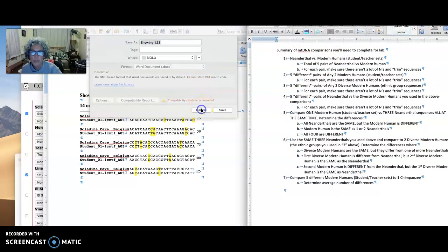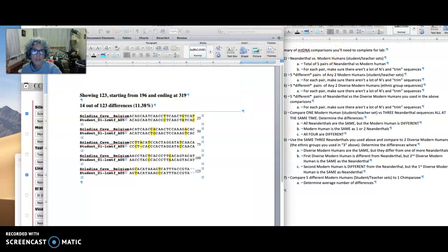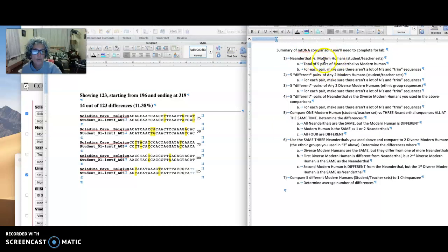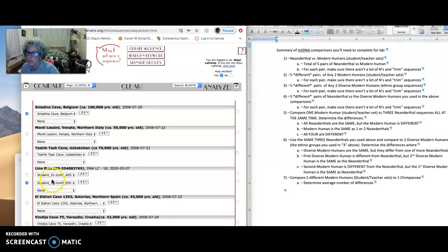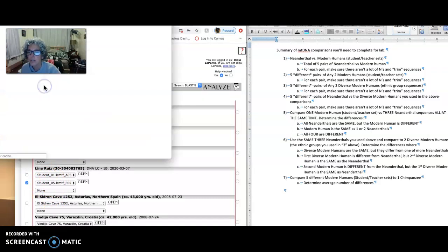Oops, let's cancel that. Need to do that for 4 more pairs. So that was 1 pair. So that was this student versus Neanderthal. I'm going to keep the same Neanderthal, and I'm going to pick a different student. So student number 5 versus that. Do a comparison.